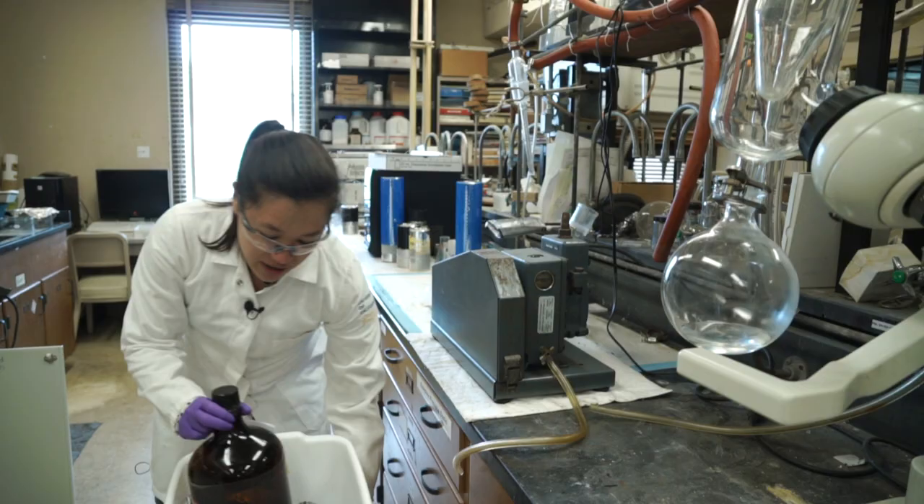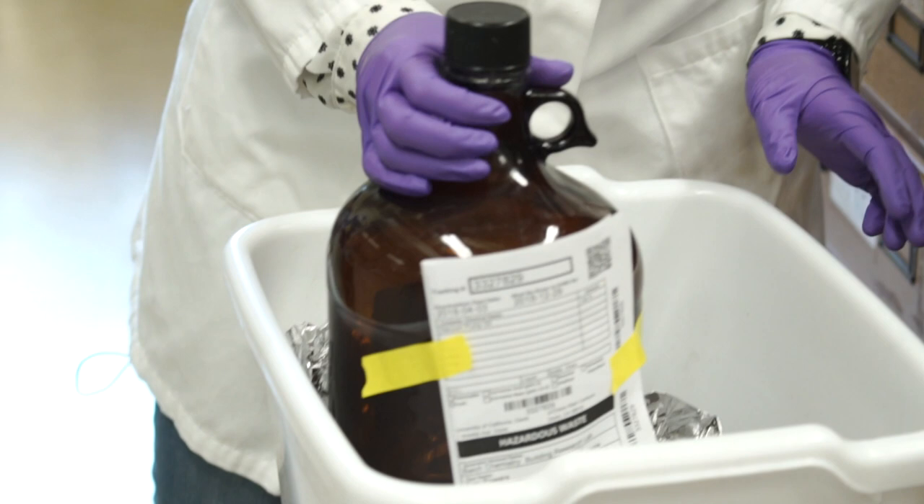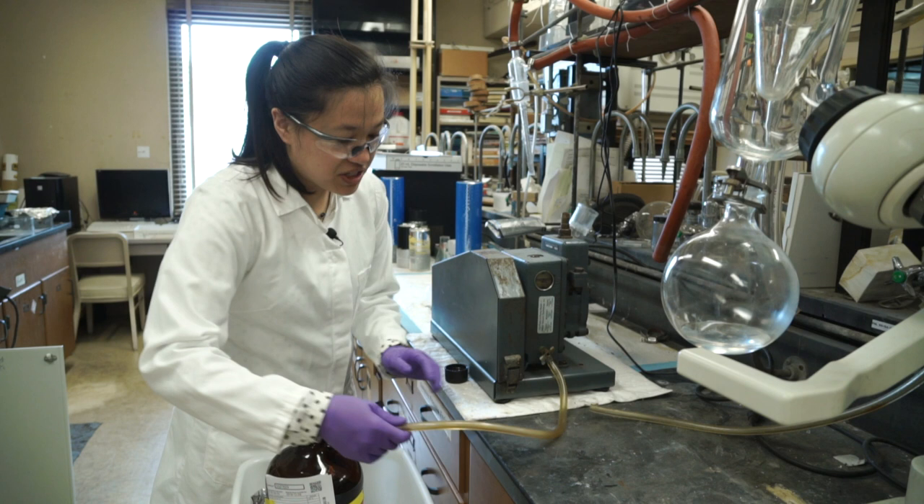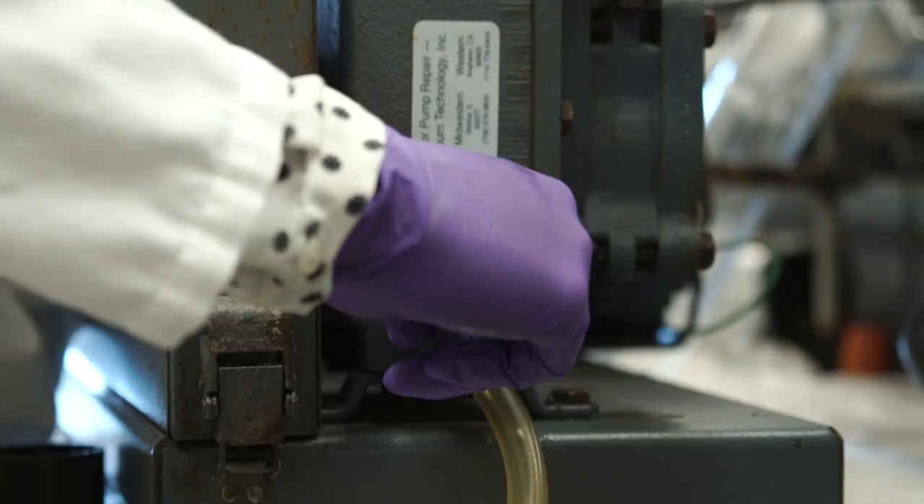Our lab prefers just using a spent 4-liter container with the appropriate waste label, because they're pretty easy to get rid of and they're very abundant. And this is actually our oil drain, so we'll just insert that into the container, and then open the valve for the contents to drain.